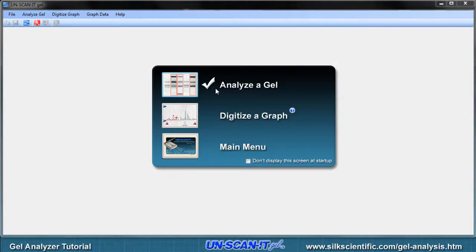A startup screen will appear when the software is opened, and a pop-up menu will allow you to analyze a gel. This option can also be selected from the main Analyze Gel menu or the Analyze toolbar.